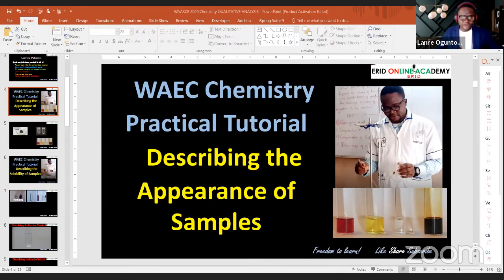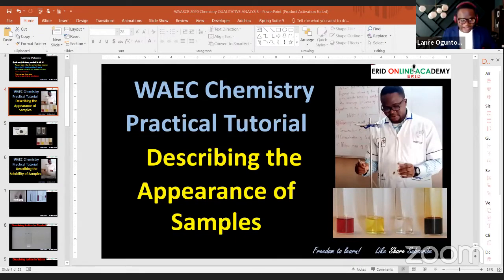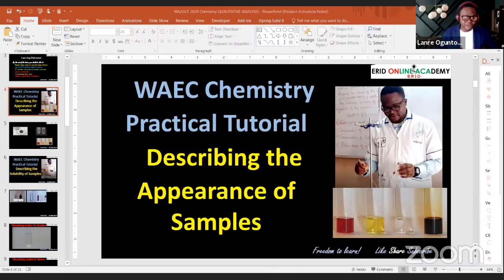I'm going to start with this, but before then, let me talk you through the materials that I will send to you. If you click on these links, they will take you to videos that explain each of these: how to add an indicator, how to fill your burette, how to handle titration apparatus, how to carry out your first titer and second titer, and how to do your calculation.